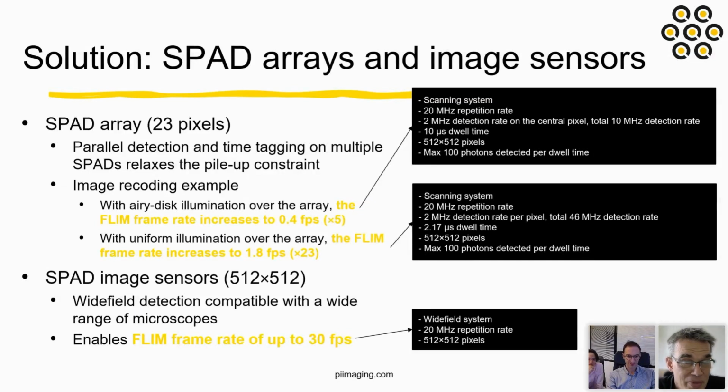Well, before I do that, I will mention that there are still some questions in the sidebar that we're looking for your responses from. But in answer to your questions, the first question was, this is single photon sensitive, not single photon counting. Is that correct? So you can't know if 3 photons arrived in a unit of time.